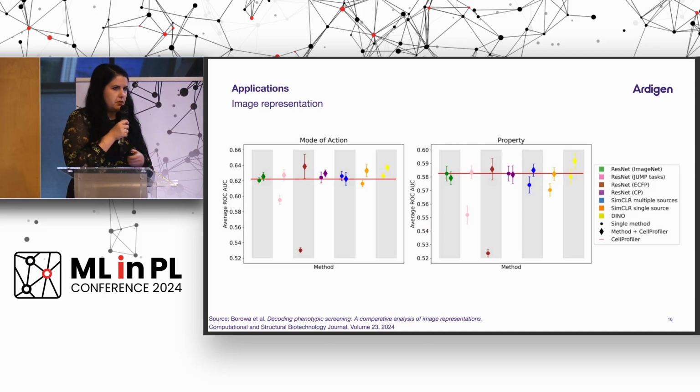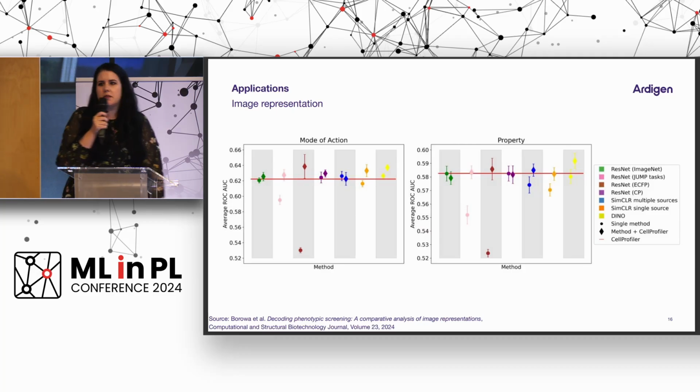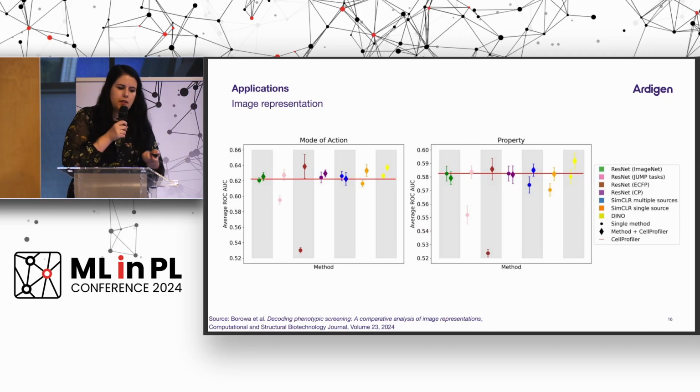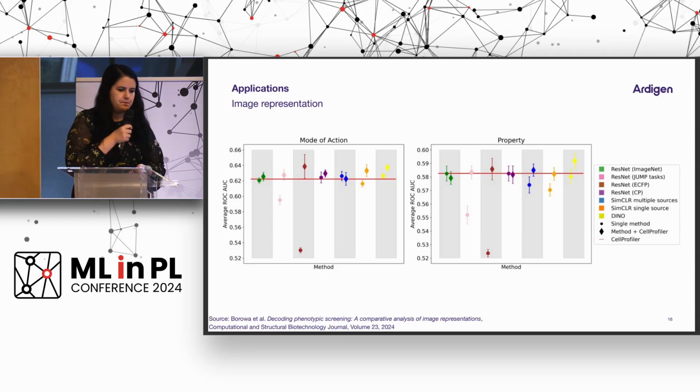And the important thing here is the dot below. This is the CNN model that was trained to predict structure. What we can see here is that structure is not showing everything, and boosting it with images actually helps. The image can actually see more than the structure itself.